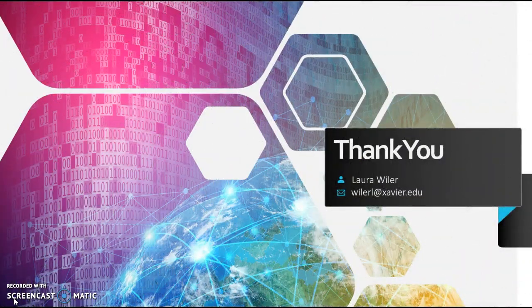The laboratory is not unlike many other business environments that are supported by information technology. There are common difficulties in design, implementation, and use of information systems in all industries. The use of computerized systems is becoming more common in laboratories across the globe, and as long as management addresses common problems involved with information systems, as they relate more specifically to the laboratory, the appropriate design and implementation of LIMS can bring increased accuracy and accessibility to the flow of production within the laboratory and operations.